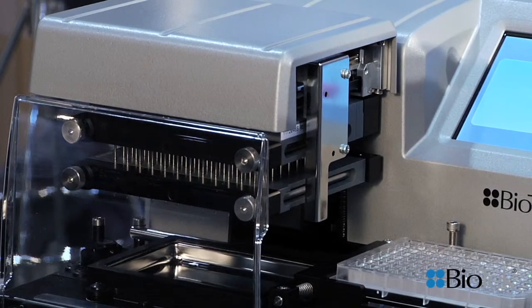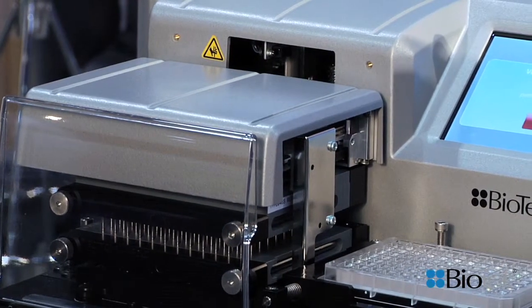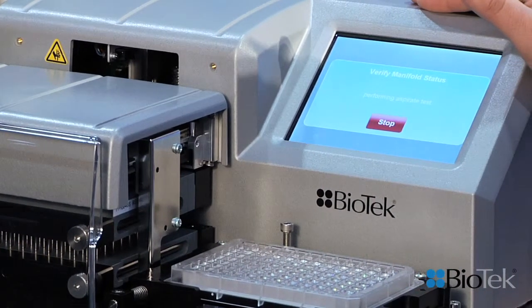You can see here I've started a run — I'll let it run. There are eight models available with this new feature and they all have the patented Ultrasonic Advantage sonicating water bath on it.